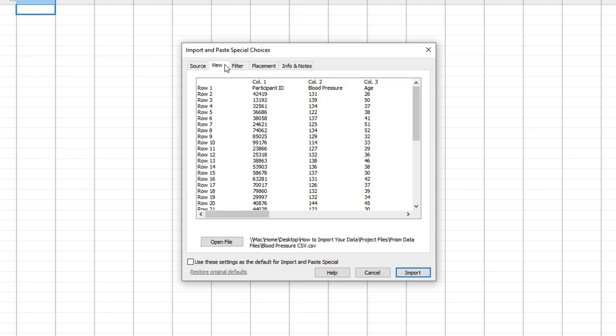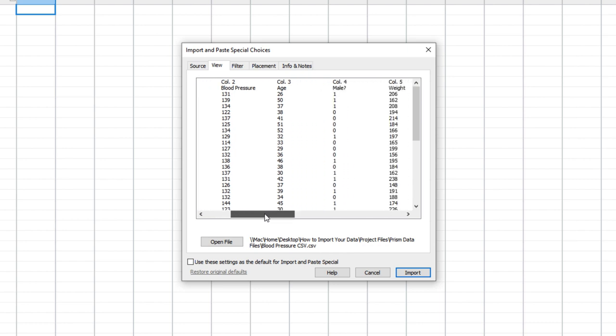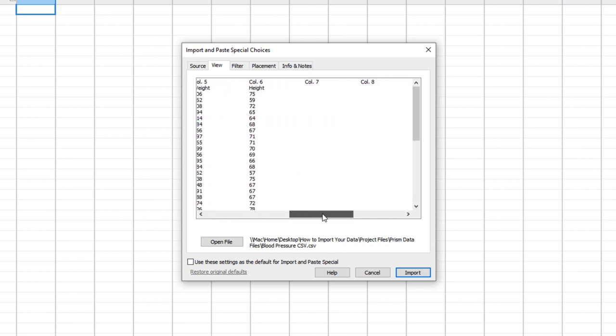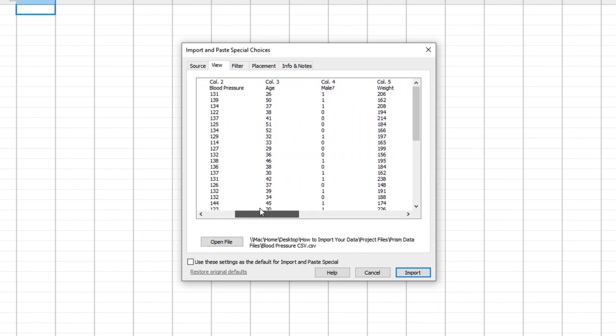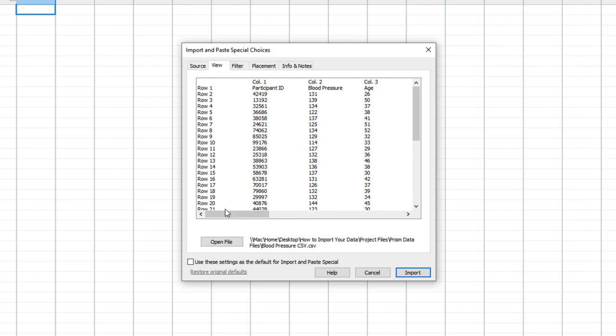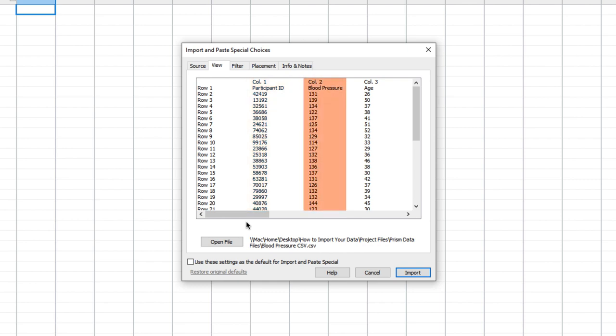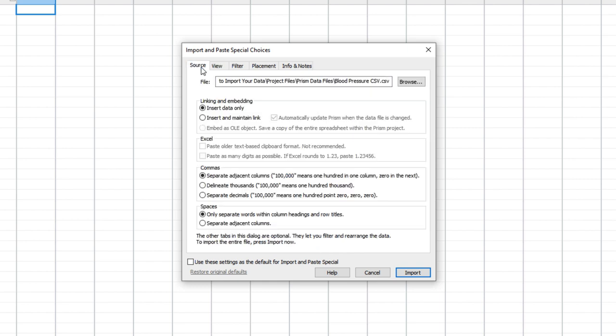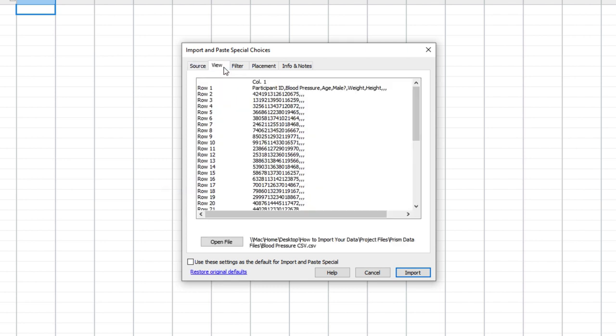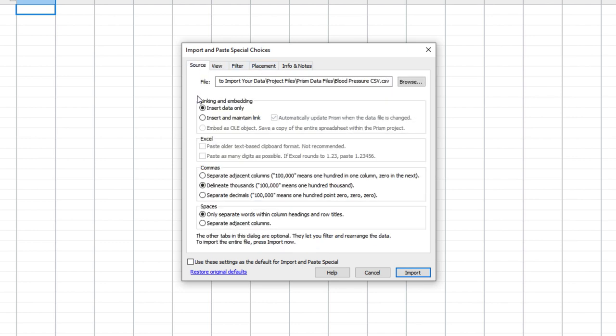The next tab, the View tab, allows you to visually inspect the values being imported or pasted, and shows the row and column arrangement resulting from the choices made on the source tab, and again provides an option to open the source file if you're importing data. We can see that our data are structured as we'd expect, with columns for participant ID, blood pressure, and so on. However, if on the source tab, we selected that commas delineate thousands, instead of separating columns, we can see on the View tab that the structure of our data has been interpreted incorrectly. So let's fix that.